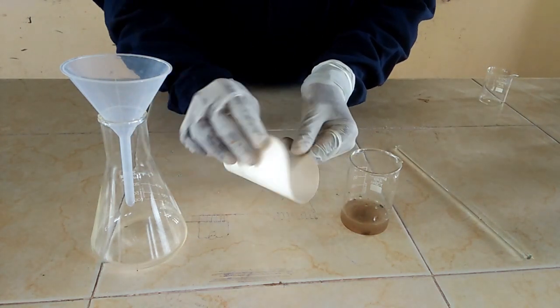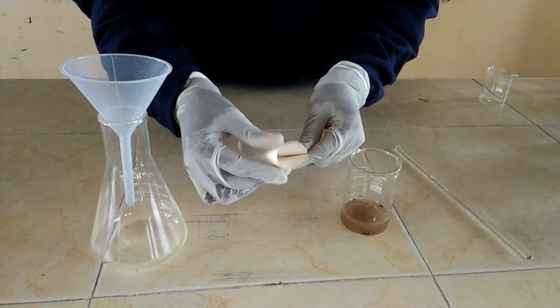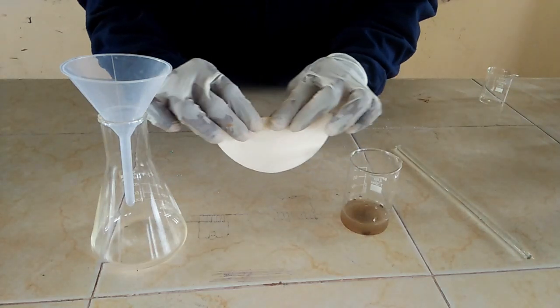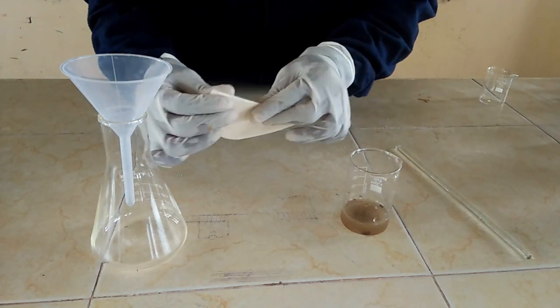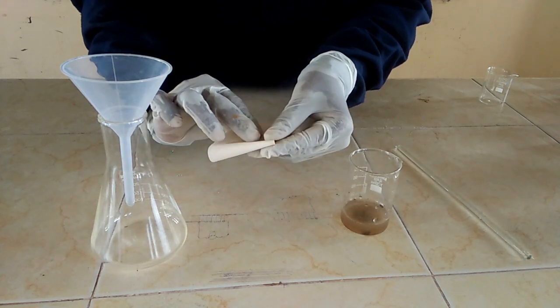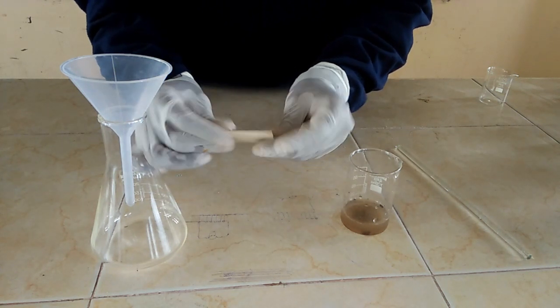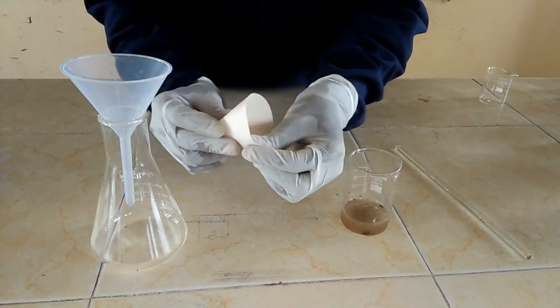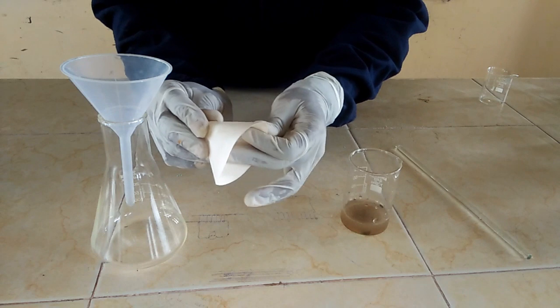So what am I going to do first? First of all, I am going to make a cone using the filter paper. You fold your filter paper into a cone.